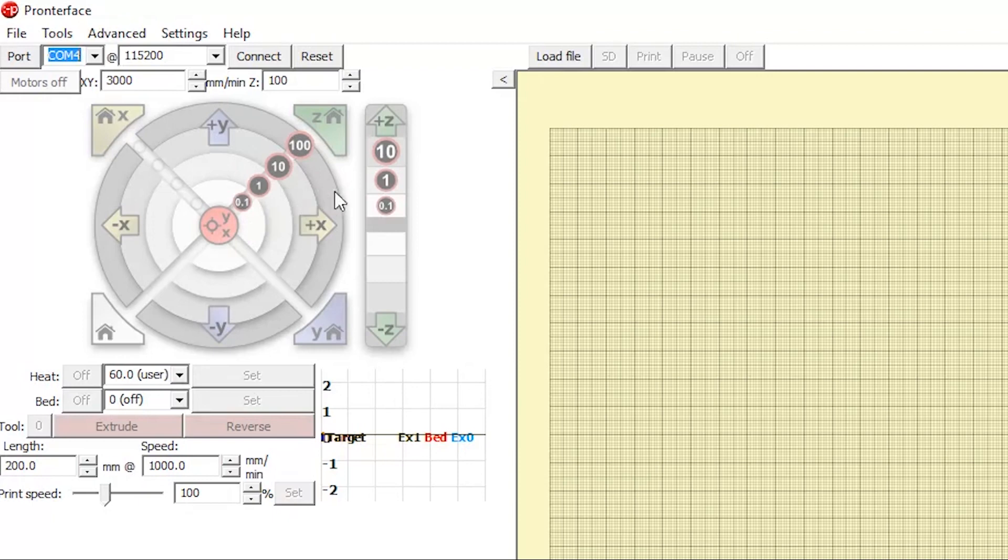You can also move the bed up and down using the plus and minus Z buttons. An important thing to note here is that Z represents the distance between the needle on your syringe and the bed of the printer.